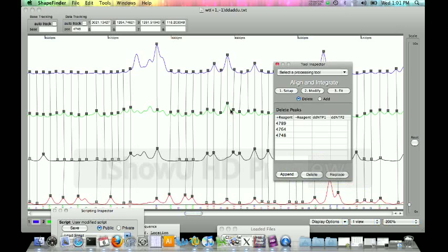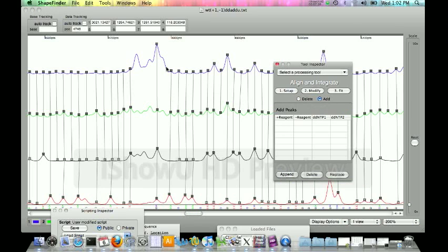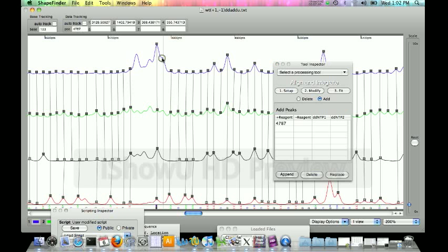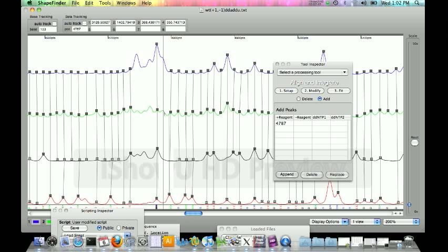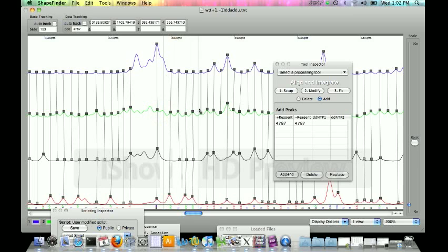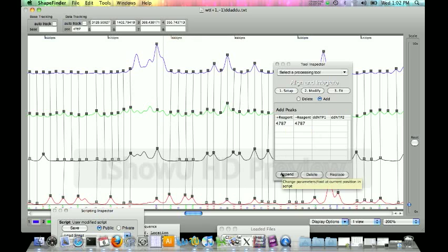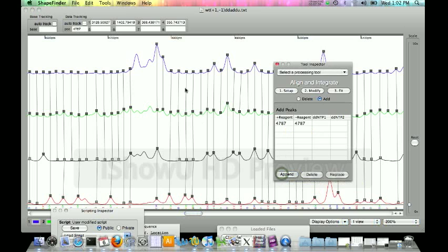Now we want to re-add those peaks using the add function. We're going to find the peak where we believe is in our first filter, click on the spot, click on it in the second filter to tie it to. Usually it's about a straight line, if the alignment worked correctly you should have pretty much up and down peaks. We'll go ahead and see 4787, 4787, the plus reagent and the minus reagent. We'll click append. No problem.